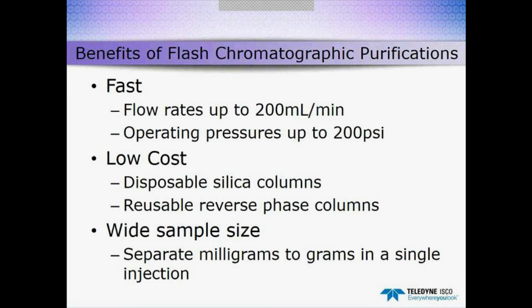I alluded to it a little bit earlier, wide sample size, the ability to separate milligrams to grams in a single injection. That's really one of the big benefits of flash chromatography over preparative HPLC systems.